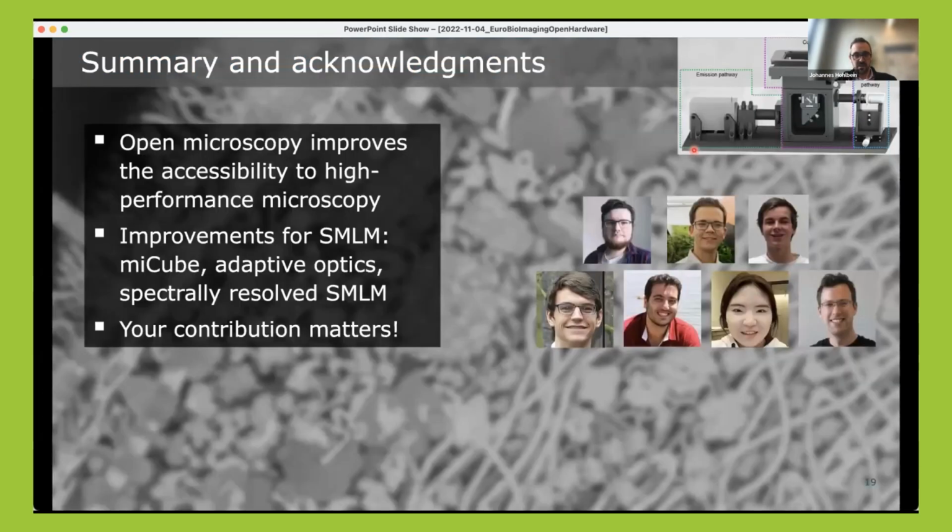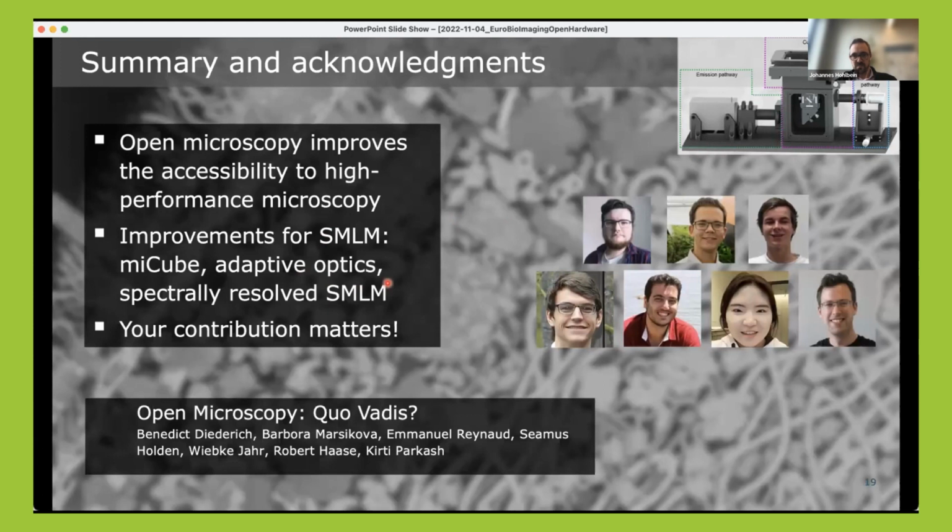I hope I'll convince you that open microscopy aims at improving the accessibility of high performance microscopy. I presented a couple of options for improvements: adaptive optics, spectrally resolved SMLM, and very importantly, your contribution matters. Whoever is working on a project, please feel encouraged to open up on what you are doing, get in touch with others, and start sharing your work.